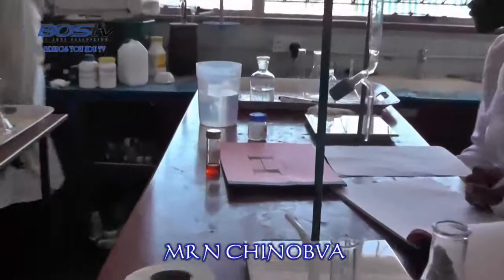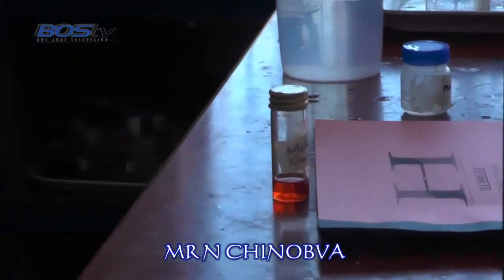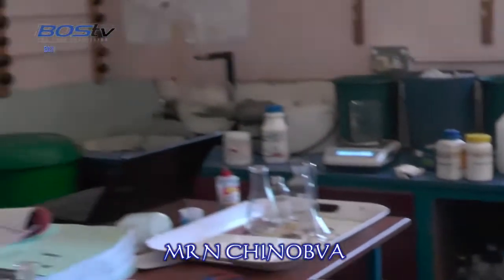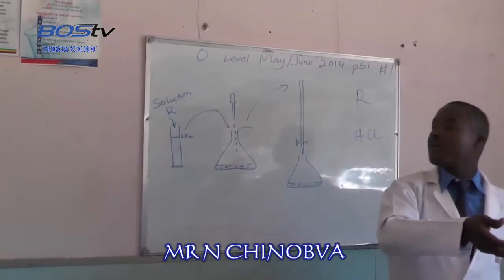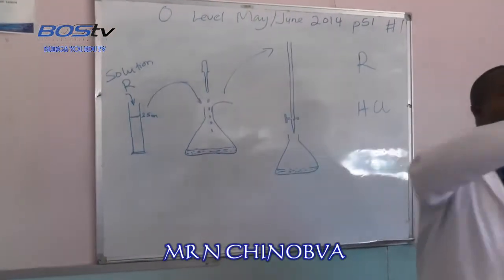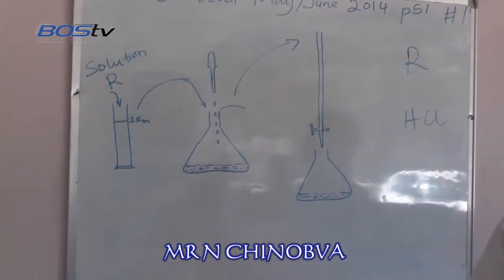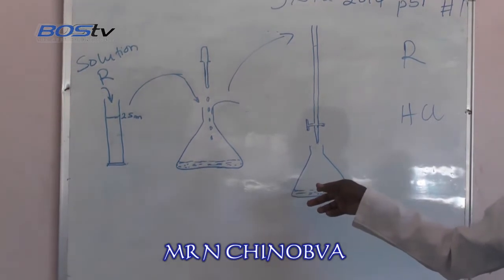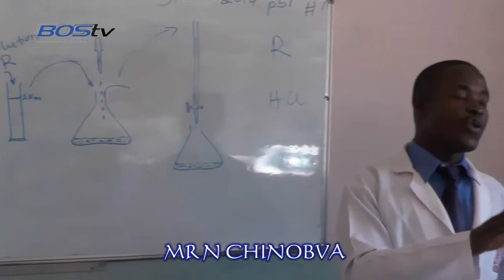You are going to measure about 25 cubic centimeters of solution R using the provided measuring cylinder. Then you measure it into a conical flask, add a few drops of phenolphthalein for the first part, then titrate using HCl. That means you add HCl into the burette you are provided with. As soon as your color turns colorless, you stop. Then you add a few drops of methyl orange indicator.